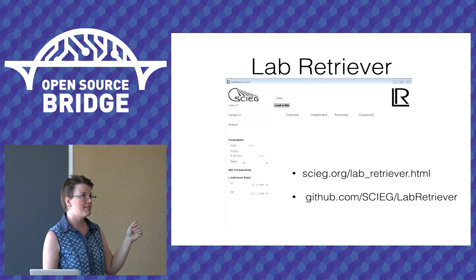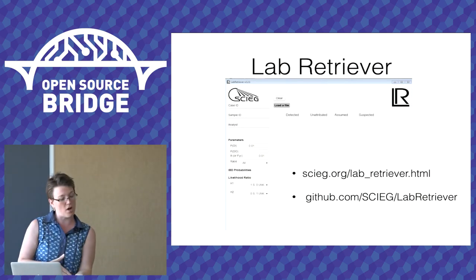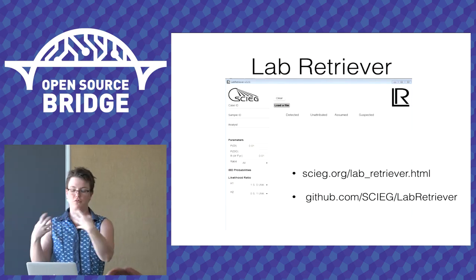The hardest part was I had months and months of validation data, so I had to crunch it to figure out my dropout possibility. That was the only hard part, not the software, but gathering the data for the input.